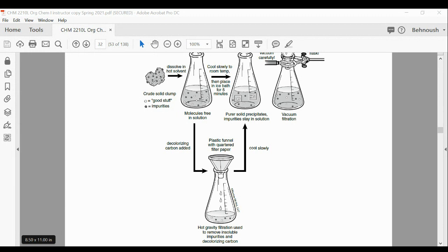What could you do to get crystals? After cooling in the ice bath, you see no crystals. How could you get crystals? And anyone who has not answered a question yet? Katania, your answer probably fits this one.